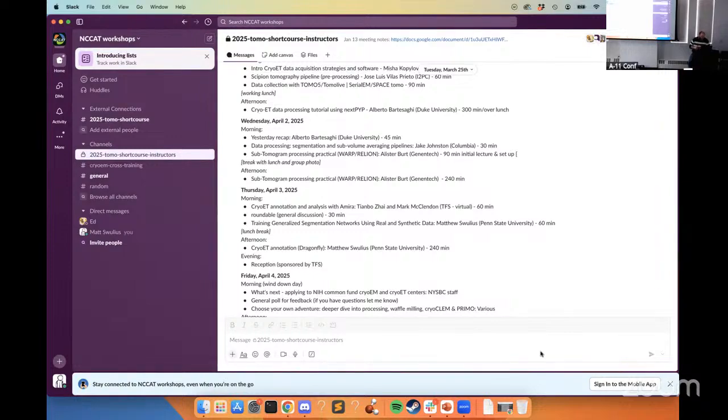You definitely want to look at your data and make sure of it. Like anything that comes out of GPT, you want to give it a once over. Same thing here.